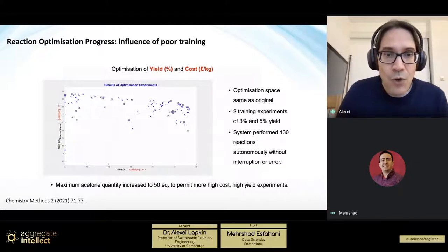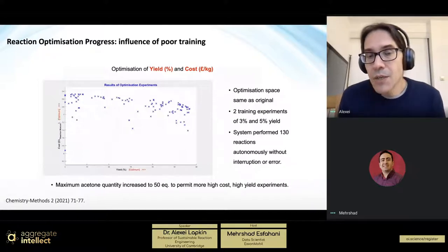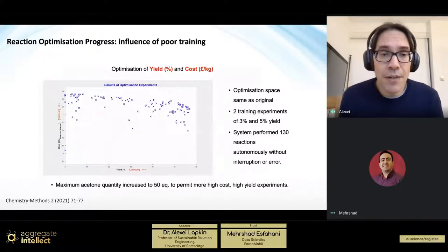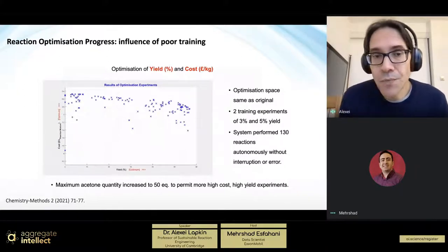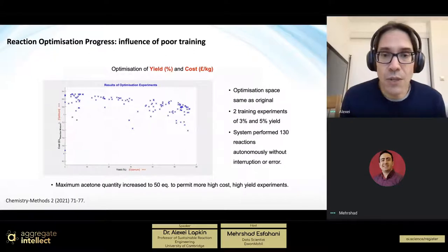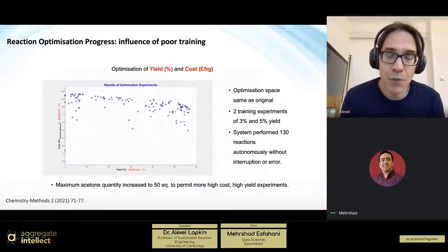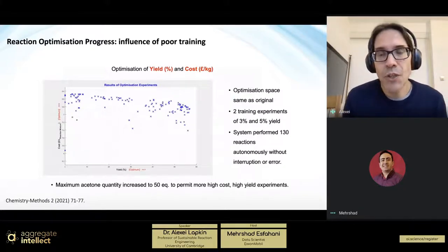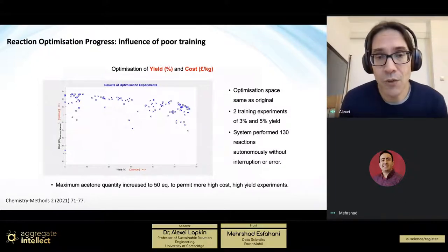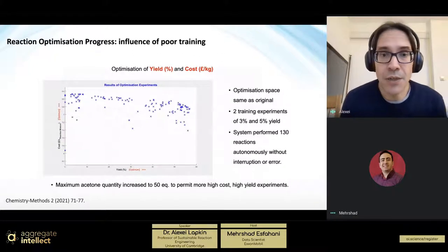So what is encouraging for us is that at this stage, in the state of the art of automated optimization, you can pick an off-the-shelf algorithm. We are using TSEMO, which has been adopted by a few groups. It's open access. You can download it. You can re-implement it. We've re-implemented it from MATLAB into Python and automated the commercial equipment using a fairly standard automation setup. Everything is automated through LabVIEW to run experiments.